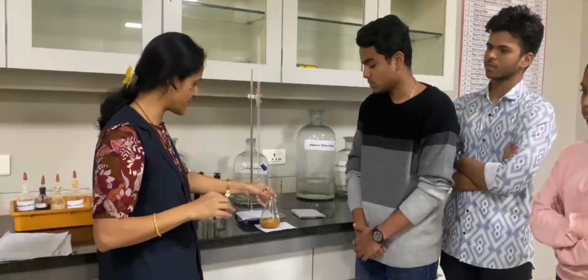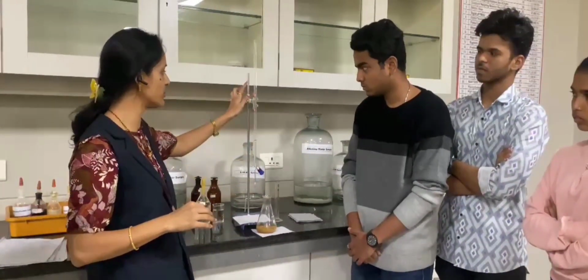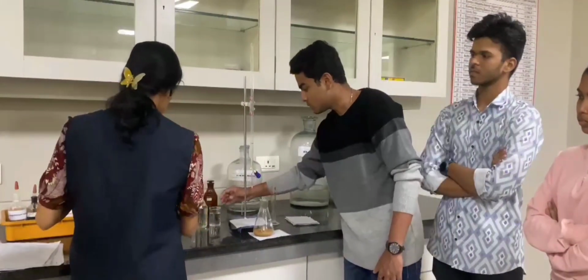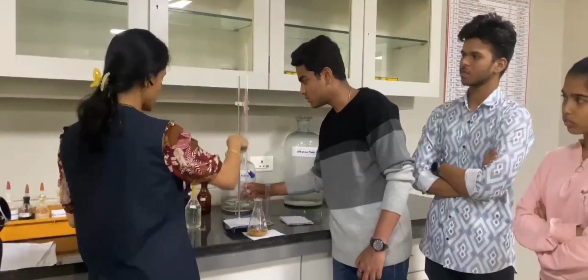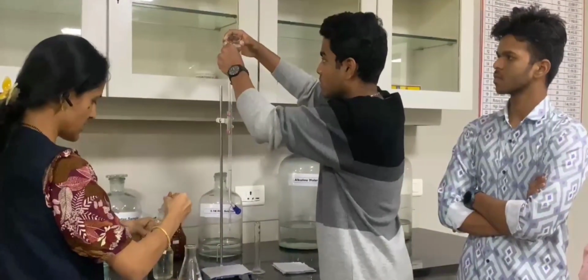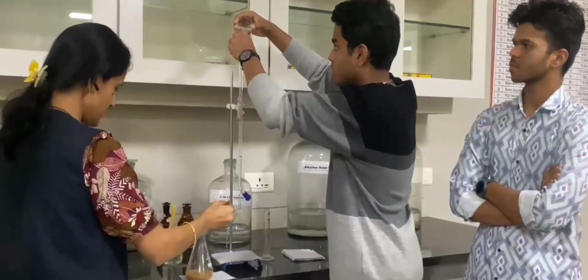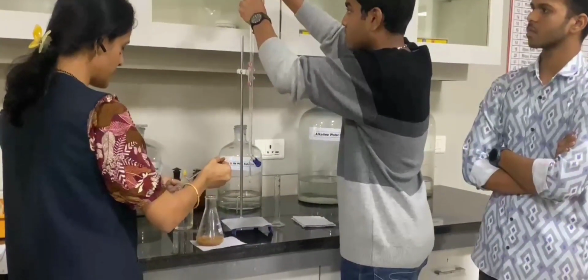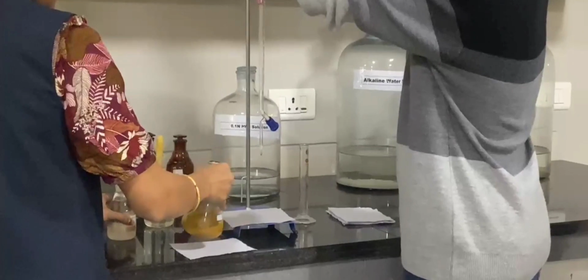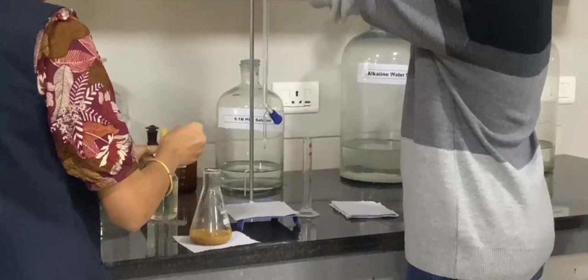So I2 is liberated, and this liberated I2 we can titrate with sodium thiosulfate by using starch as an indicator. Now I am adding the starch indicator.